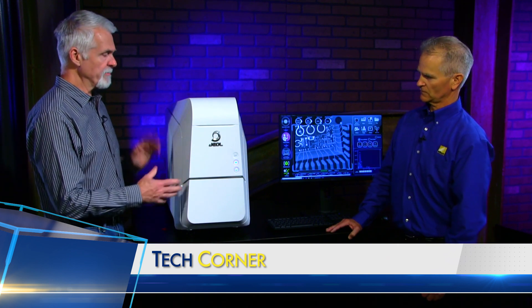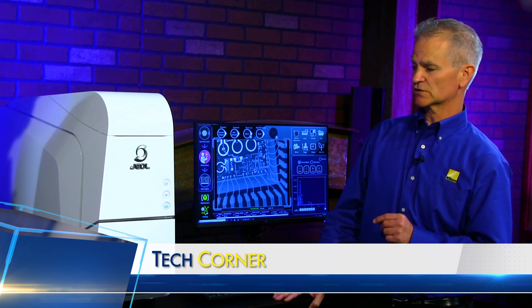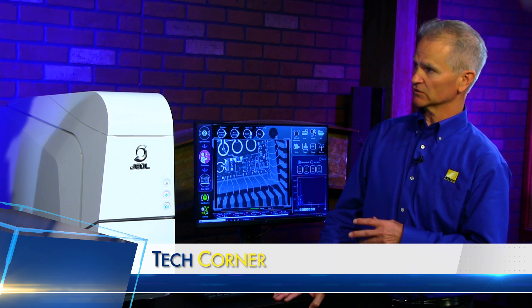Tell us more about the JEOL then. This is a brand new JCM-7000, the latest in multiple generations of the benchtop SEM. This is a big jump in technology from the previous version, the JCM-6000+. It has higher magnifications, a backscatter and secondary detector, and two different modes for low vacuum so that we can better image non-conductive samples.